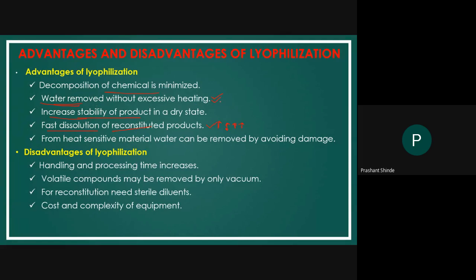Increased stability of the product in the dry state is related to the removed water. We all know that when you dry the product at high temperature, there are chances of degradation of your biological material due to fermentation. If fermentation is there, that is biological degradation of the matter. So ultimately, stability will be increased if you dry this product at low temperature.